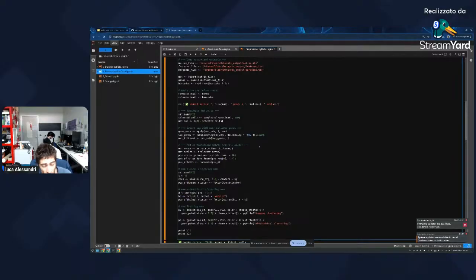And this is a very important concept to understand: just because you don't have the results that you expect doesn't mean that the algorithm is wrong, and it doesn't mean that what you see is wrong. Maybe it's the only thing that you can see here, or maybe you can do some adjustment. So changing the parameters is not really seen as a manipulation of the data, but you have to be careful, because if you torture a person for 1 year, at some point, the person will tell you whatever you want to hear.